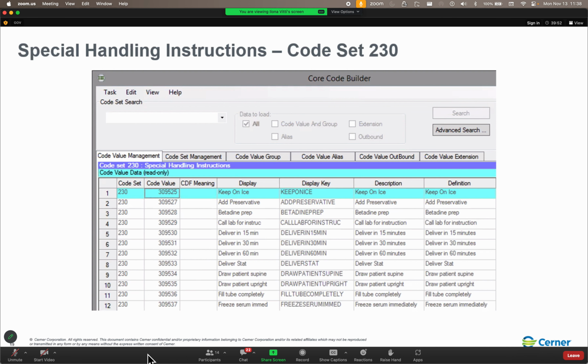That's a little more advanced. Well, as you read up on the reference pages on it, it will talk about it. I am just letting you know that the accession assignment pools tab is where you would do it.